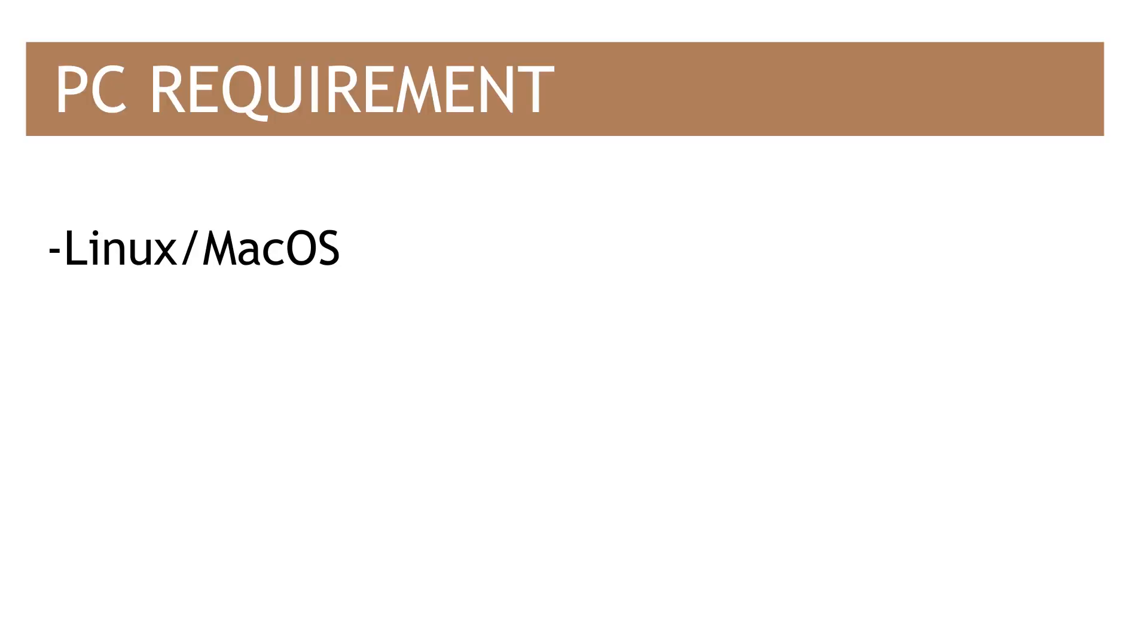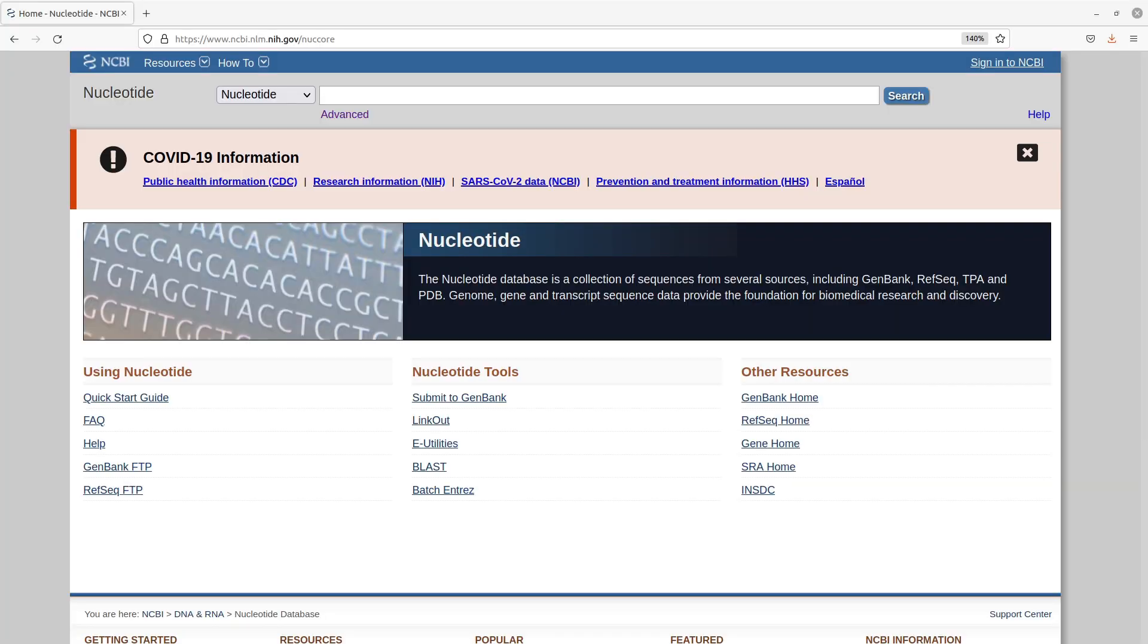For this tutorial, the only requirement you need to satisfy is to have a Linux system. You can also run this in a Mac system, so any of them should be fine. They are all Unix-like operating systems.